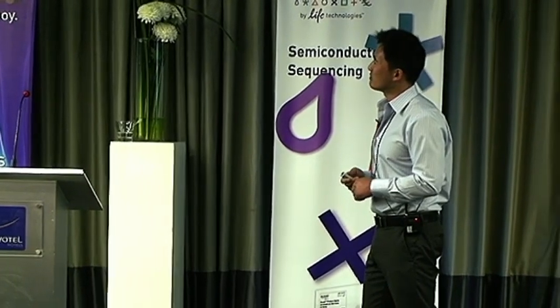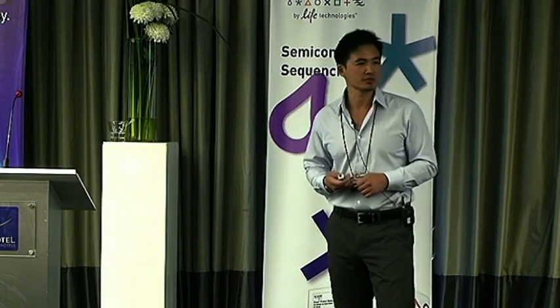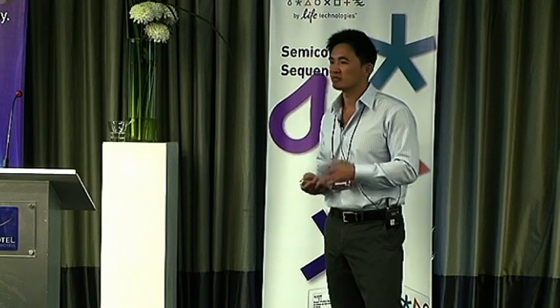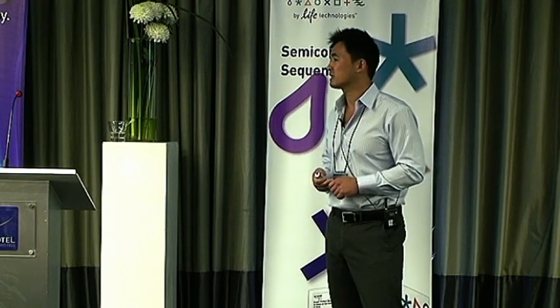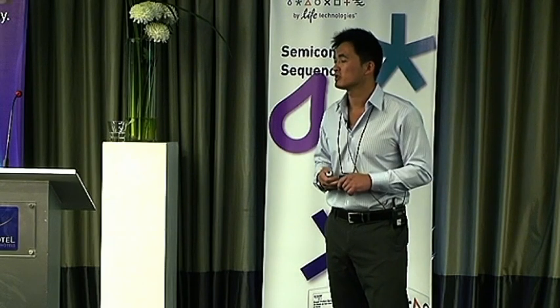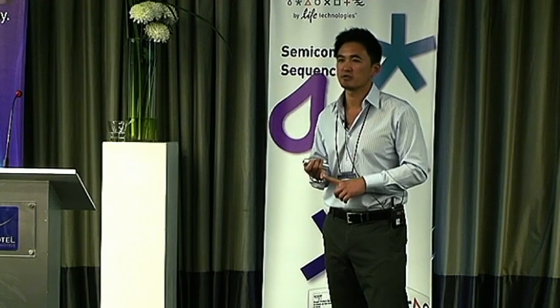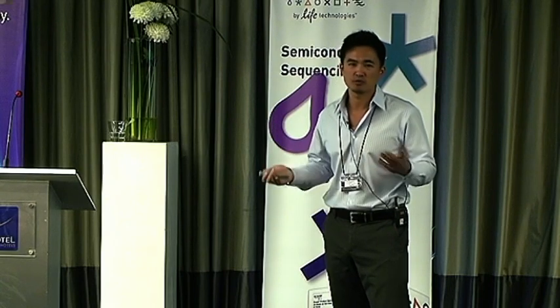One of the things that we found out right away that was needed was the illumination source. There are a lot of different real-time instruments out there that use different illumination strategies. Even within Life Technologies, if you look at all the instruments that Tony introduced earlier in the presentation, we use a variety of light sources. We use focused-wavelength LED lights. We use broad spectrum halogen bulbs.